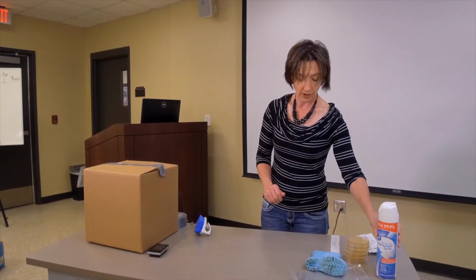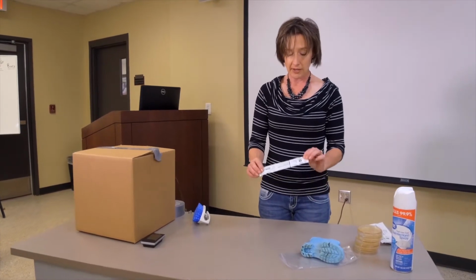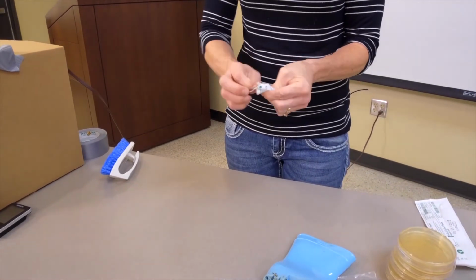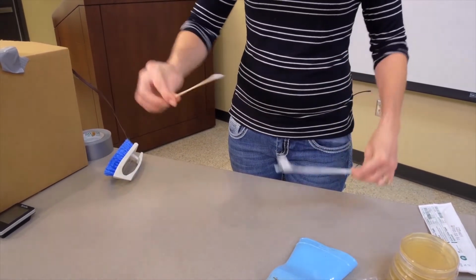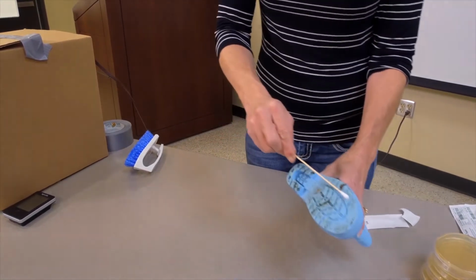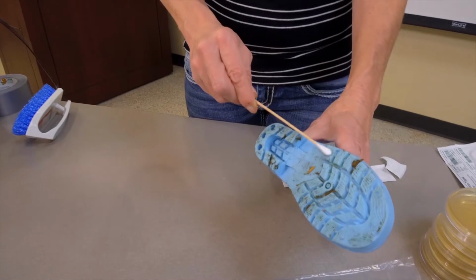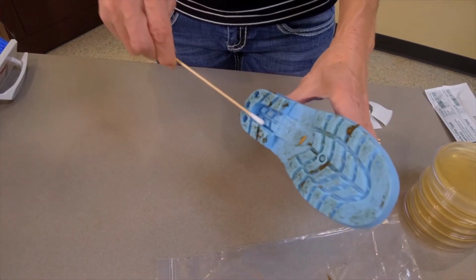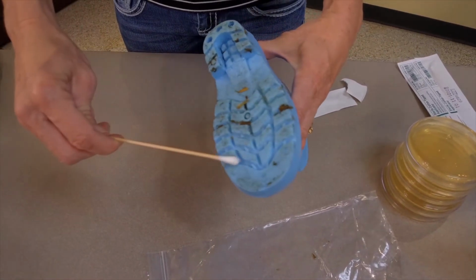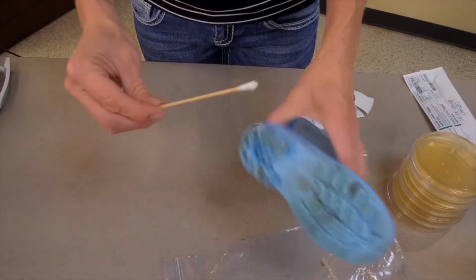So we'll first start with our boot that might be a typical boot that might come into the house. We're going to grab a sterile swab, and when we open the swab, we want to make sure that the students don't touch any part of the actual cotton swab. So we're going to hold it by the stem. Then we're going to take our swab and just roll it essentially back and forth across our boot surface, taking time to roll the swab as you go, essentially to coat it with the bacteria, the debris that might actually be on our boot. So a simple swab rolling back and forth across our boot surface.